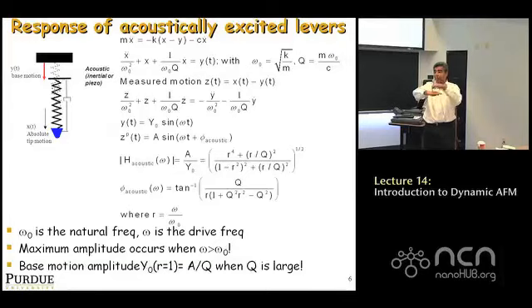What would the photodiode measure? Would it measure x? No. Remember, it measures the slope at the end, the bending angle at the end. If the cantilever just moves up and down in parallel, the photodiode does not pick up any signal. The way the photodiode works is, it is most sensitive to rotation. Unless the cantilever bends and rotates, if it just goes up and down, it's hardly going to pick it up, because it's a triangulation.